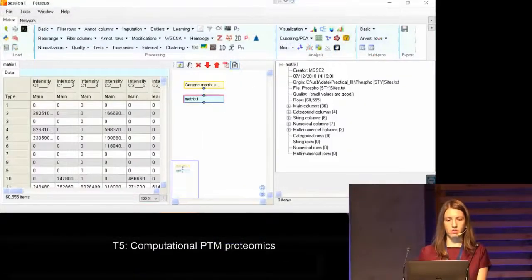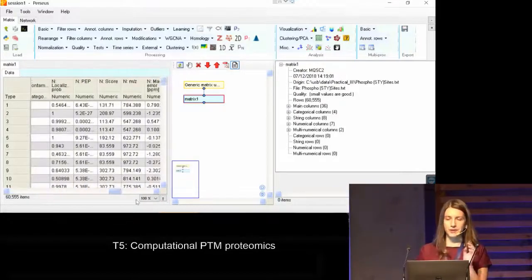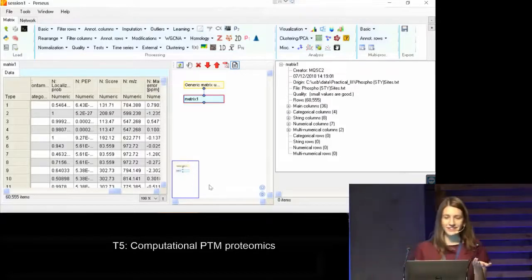ID is numerical, yes. I usually added it under text. That's a good question, because just thinking about steps in the future, if you want to match between different tables based on identifiers, you would actually match text columns. So it is numbers usually, but because in the matching you match text columns, I put it under text.